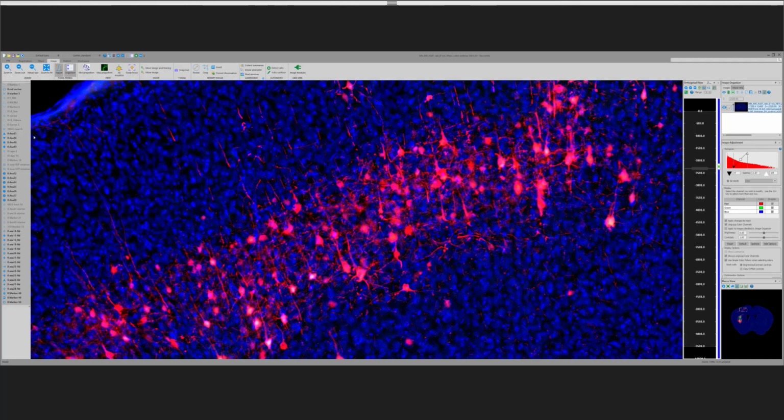So in this program, we can also detect the individual neurons. I've done this before, and we're going to have a webinar on this separately to show that, but we can see the neurons. There are pyramidal neurons in the cortex projecting to the striatum.